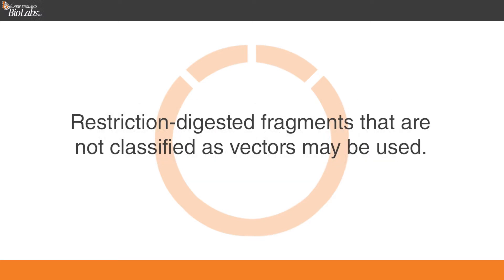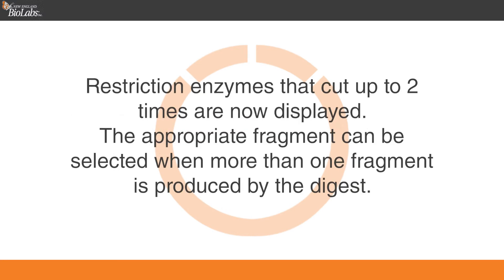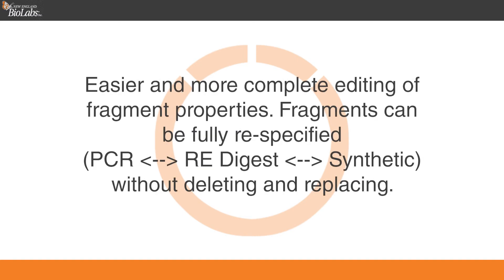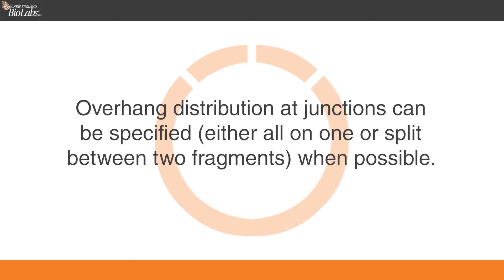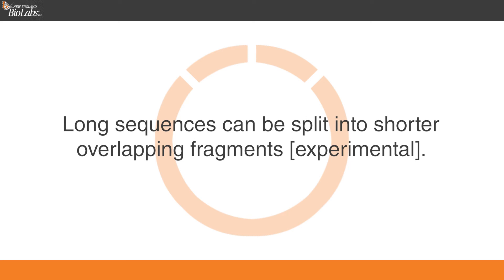Restriction digested fragments that are not classified as vectors may be used. Restriction enzymes that cut up to two times are now displayed, and the appropriate fragment can be selected when more than one fragment is produced by the digest. Easier and more complete editing of fragment properties is available, and fragments can be fully re-specified without deleting and replacing. Overhang distribution at junctions can be specified, either all on one or split between two fragments when possible. Long sequences can be split into shorter overlapping fragments.